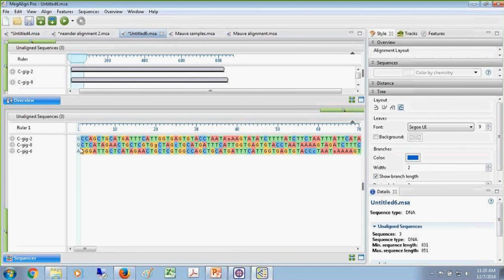So these are clones of a particular nuclear gene from a single plant. It is an allopolyploid plant, so you have what is effectively multiple species hybridizing together to form this plant. So you end up with the genomes of different species brought into the single genome of this plant.